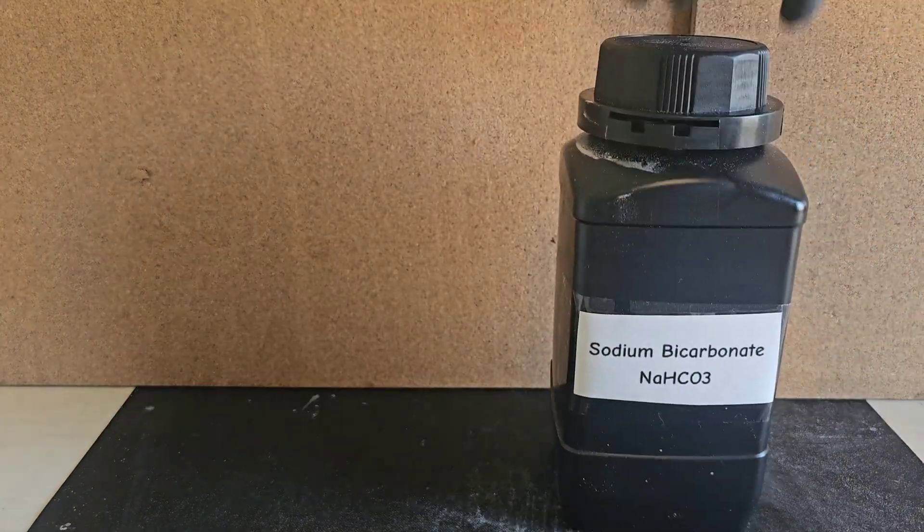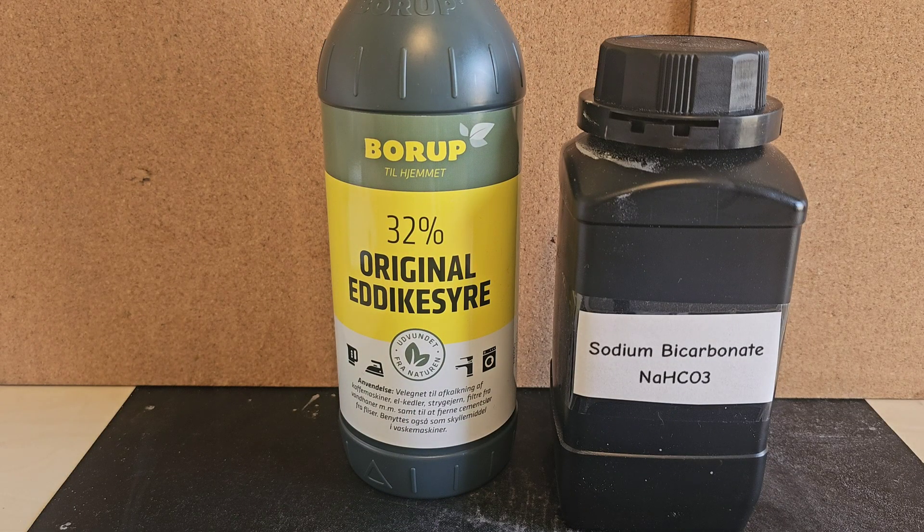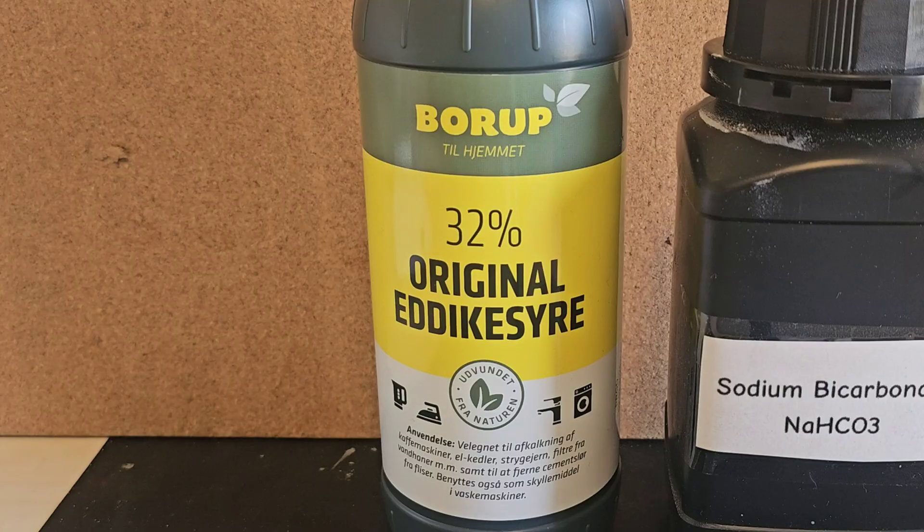You will need some baking soda and acetic acid. You can use normal household food vinegar, but I recommend getting the stuff for cleaning as it has a higher percentage of acid, so we can get a better yield without needing to boil away several liters of vinegar. I am personally using 32% acetic acid, which you should be able to find in most stores in the cleaning section.